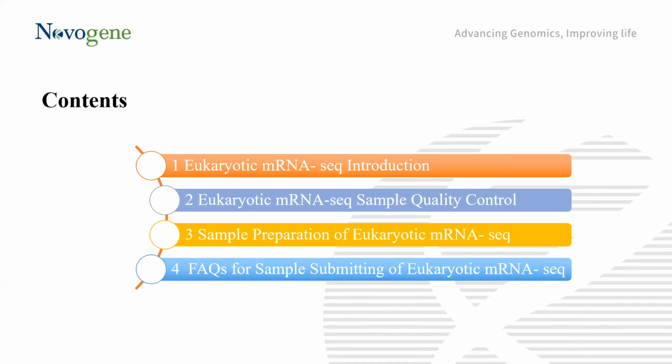First, I will give you a short introduction on eukaryotic mRNA-seq. And second, we will look into the methods: how to check the quality of the sample, what the sample requirements are, and we'll give you short guidelines on how to prepare good quality RNA for eukaryotic mRNA-seq.